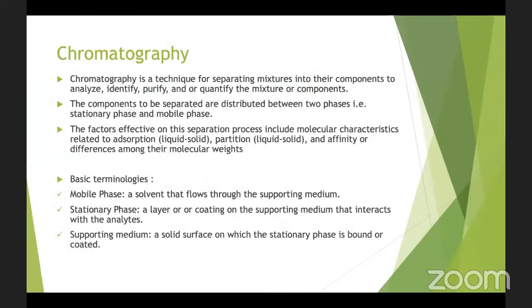Now, what exactly is chromatography, if we talk in terms of definition. Chromatography is a technique for separating mixtures into their components to analyze, identify, purify, and/or quantify the components of the mixture. The components to be separated are distributed between two phases, the mobile phase and the stationary phase.